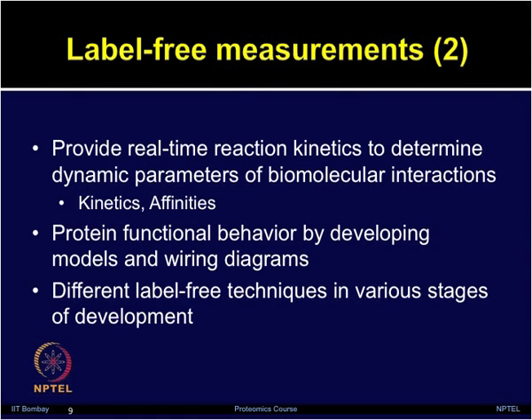The protein function behavior can also be studied by developing various types of models and wiring diagrams once you have obtained the kinetic values from these experiments, which is not possible from the label based methods. So, there are different types of label free techniques which are currently in various stages of development.